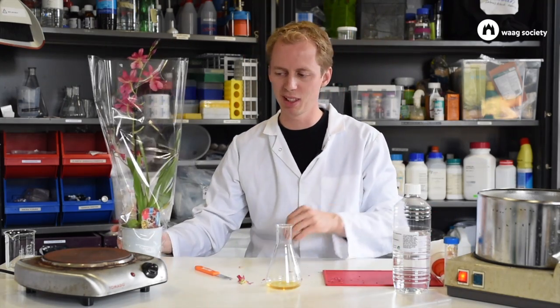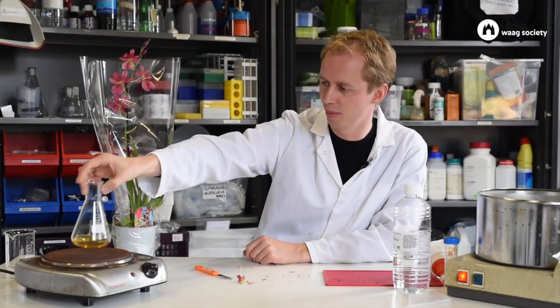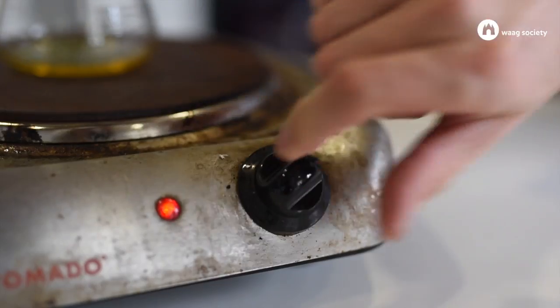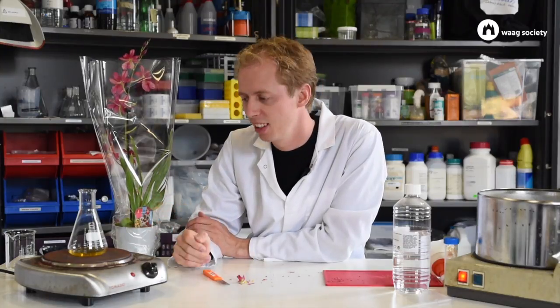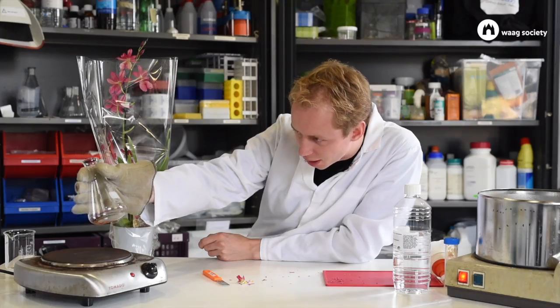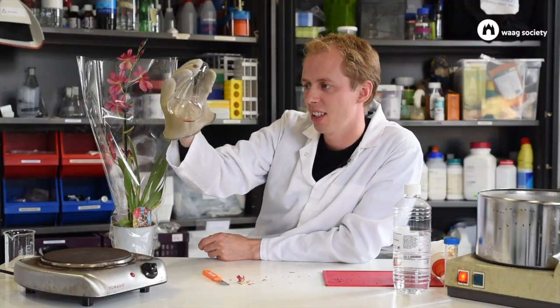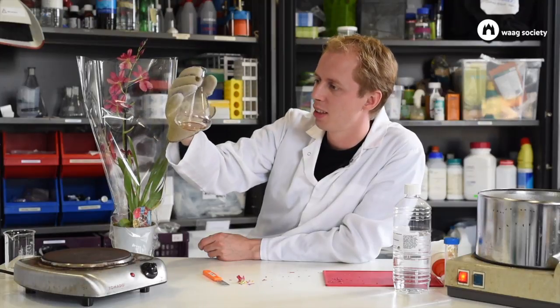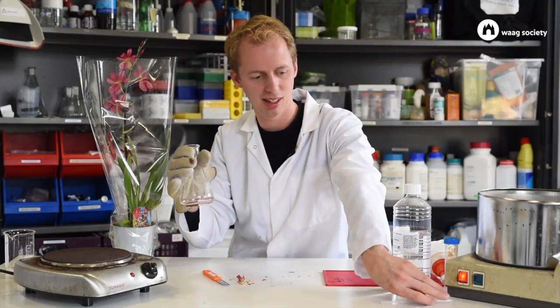Now we have about 20 to 25 milliliters left, but we want to concentrate this a little bit more. So I'll put the glass on a hot plate and heat it up for a moment — about five minutes. You have to watch the liquid closely; you don't want the compounds to burn inside. There has to be a little bit of liquid left at the end of this step. A little bit of liquid is left and some of it is already stuck to the side, so we can try to suck it out with a pipette.